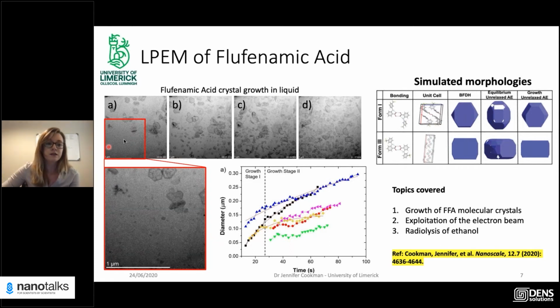But in the area that's highlighted, you can see that there's absolutely nothing in view. And then over a period of 2 minutes, you do get this nucleation of crystals and dynamic movements of crystals that were already there from a previous experiment, but even the ones that are formed, they cause this chaotic display of nucleation that have a characteristic hexagonal shape.